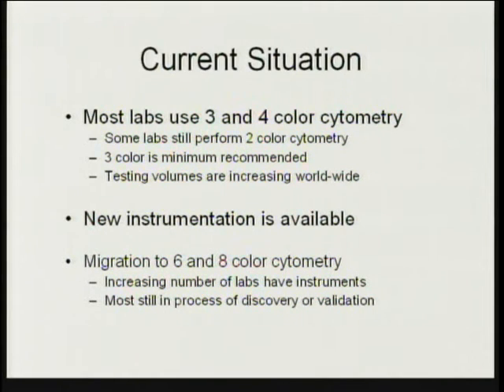But these labs are still out there. The testing volumes for flow cytometry, however, as a result of the increased recognition of its utility, are increasing fairly rapidly, and our volume continues to increase at a rate of at least 15% or so a year for the last 5 years. So the technology is important.